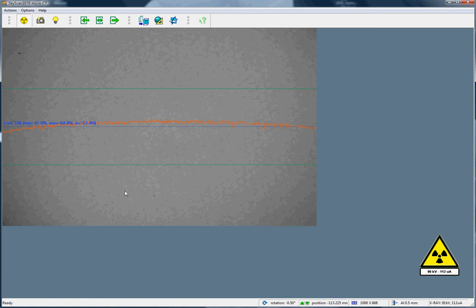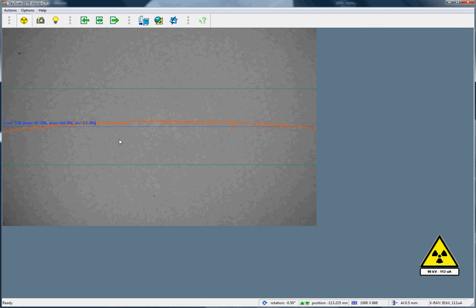Now, it's important that the average intensity, shown here in the blue text, is close to 50%, say between 45% and 55%. Why this? Well, there are technical reasons. If the value is too low, the image is too noisy, and the counting statistics are too weak.